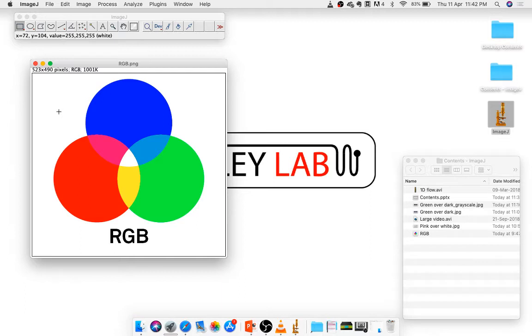Similarly, if you were to go to red, pure red color, its RGB representation would be 255R, 0G, and 0B. So let's try that. This is my R, and I can see that my intensity value is 255, not quite 0, but 14, and 0. So it's very close to red, but not exactly red, but you get the idea. Similarly, when I go to green, my middle value should go to the maximum, which is 251, and the other two values are, in this case, 0 and 56. I'm always referring to numbers that are showing up here. And similarly for blue, the blue value will be the highest.